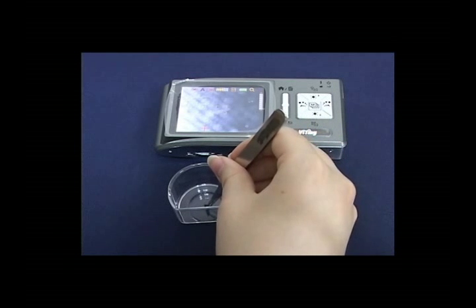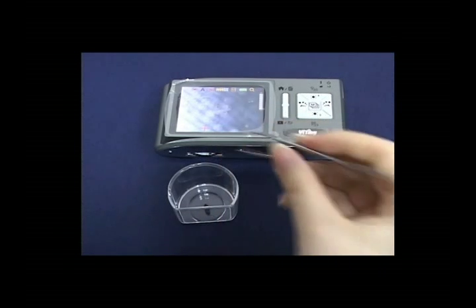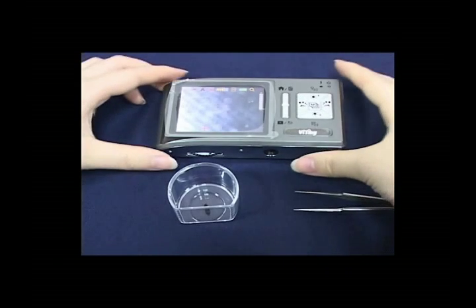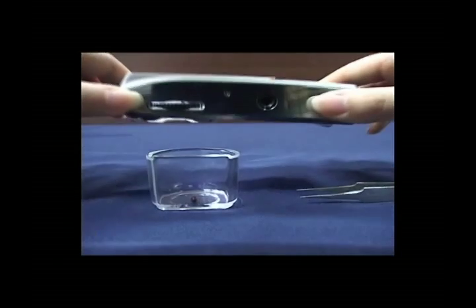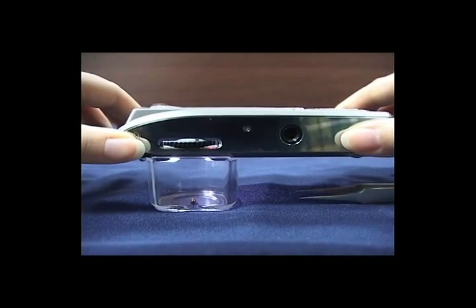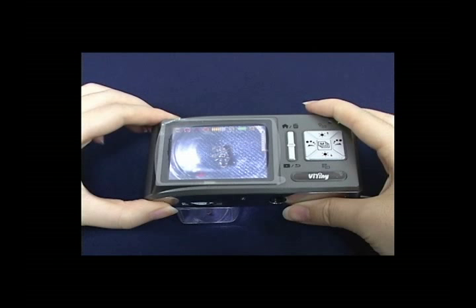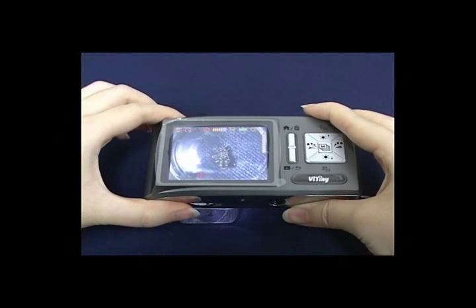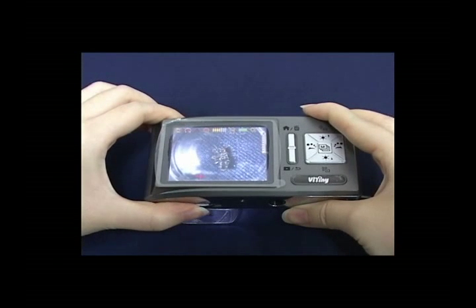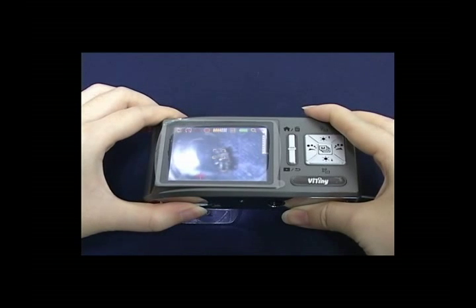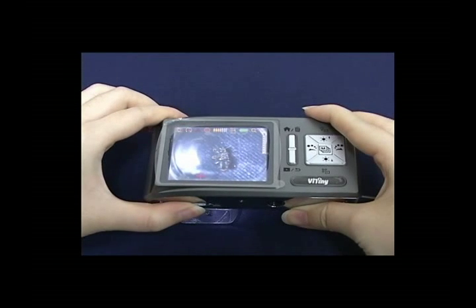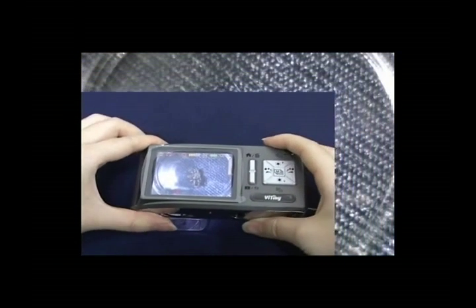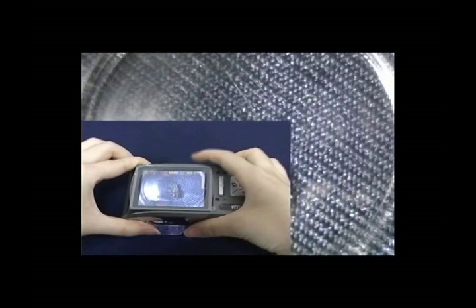When observing objects, place them into the deep tank, which you place above the machine. Deep tank is used to observe insects, rocks, and other bigger objects. Adjust the focus and lighting to start observation.